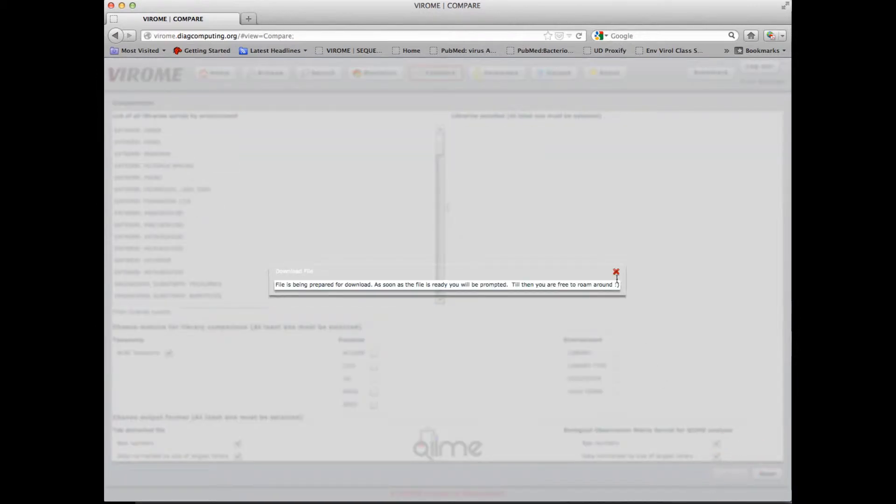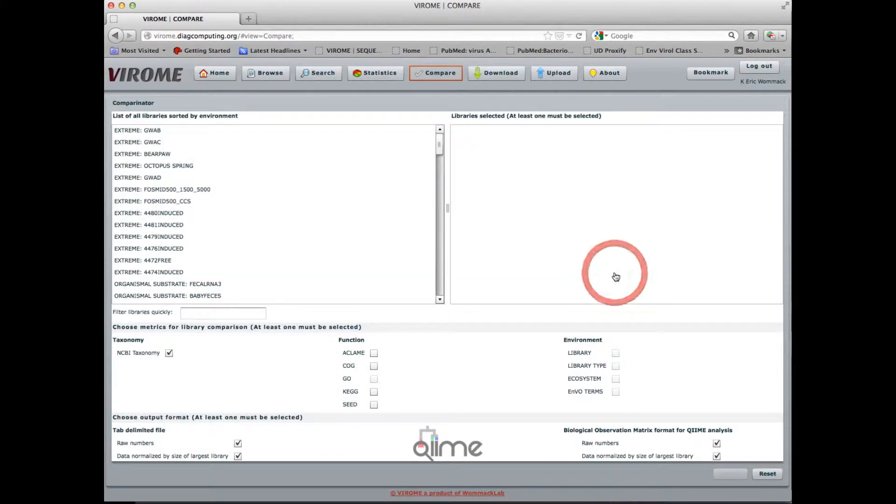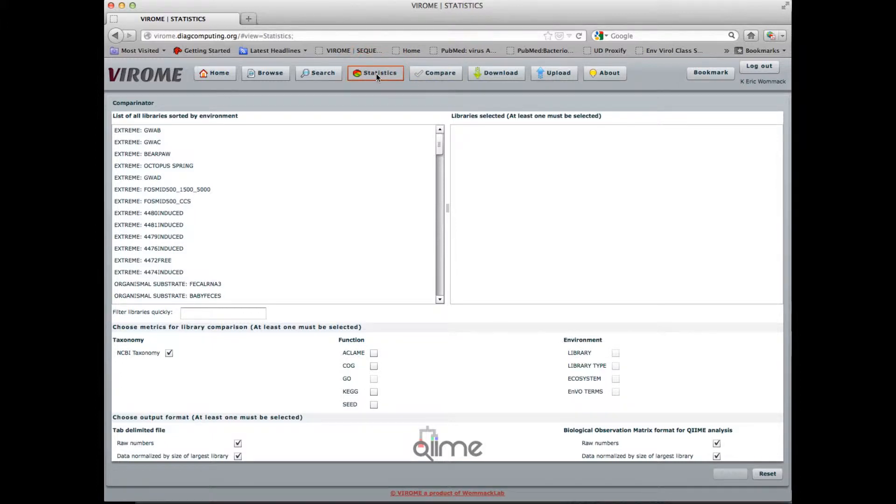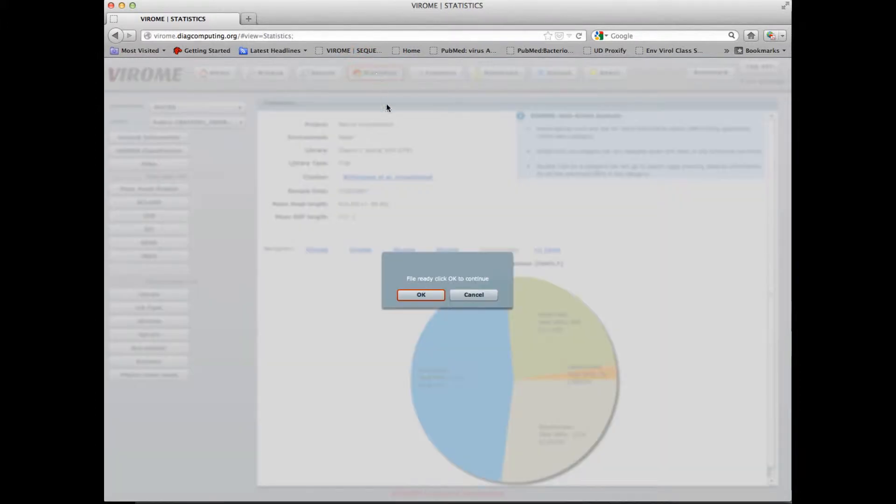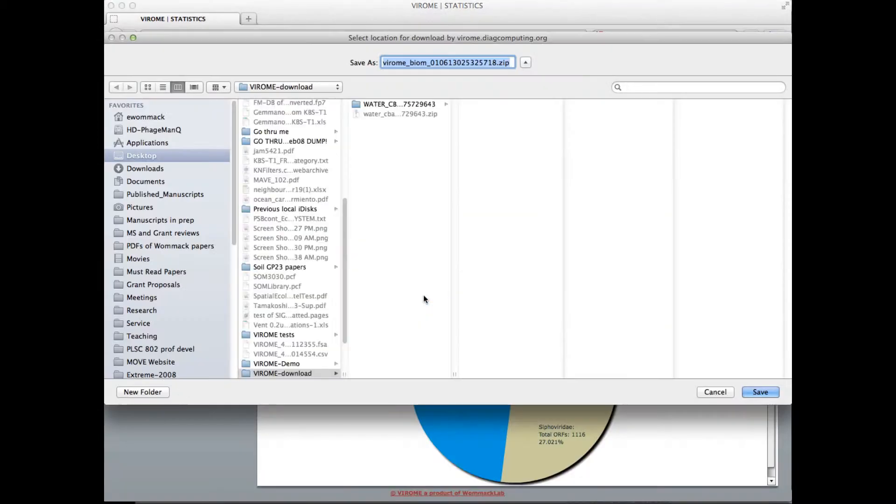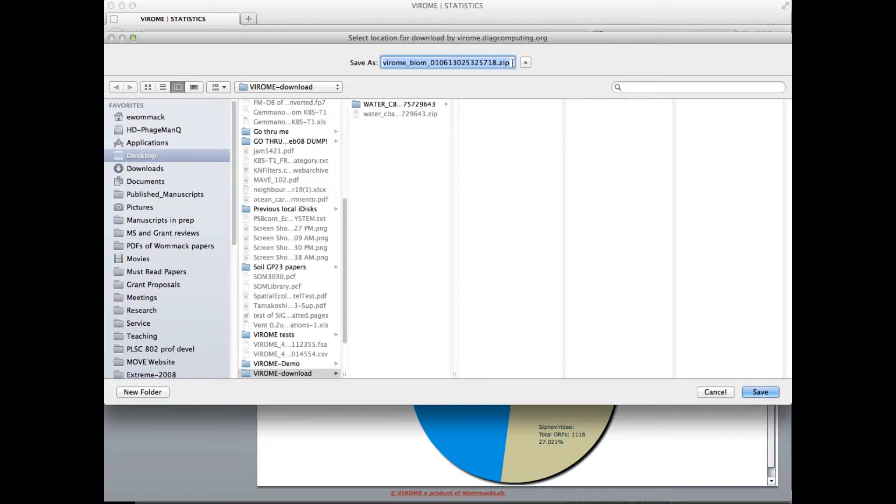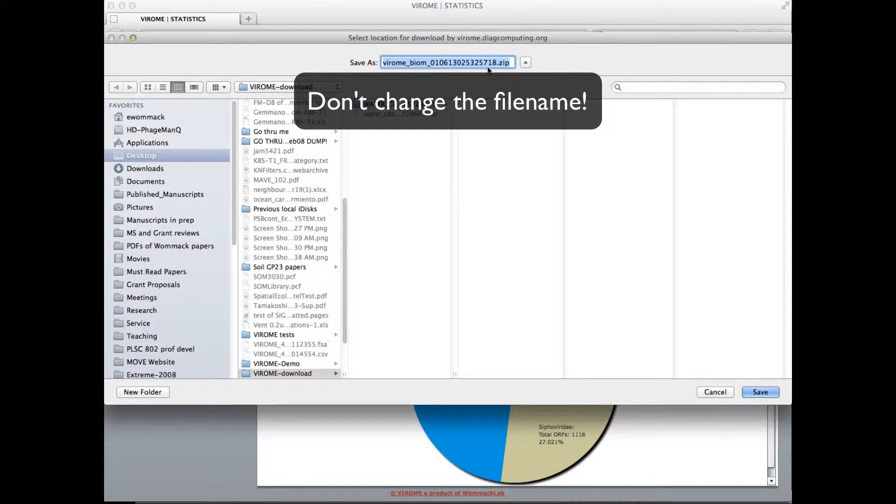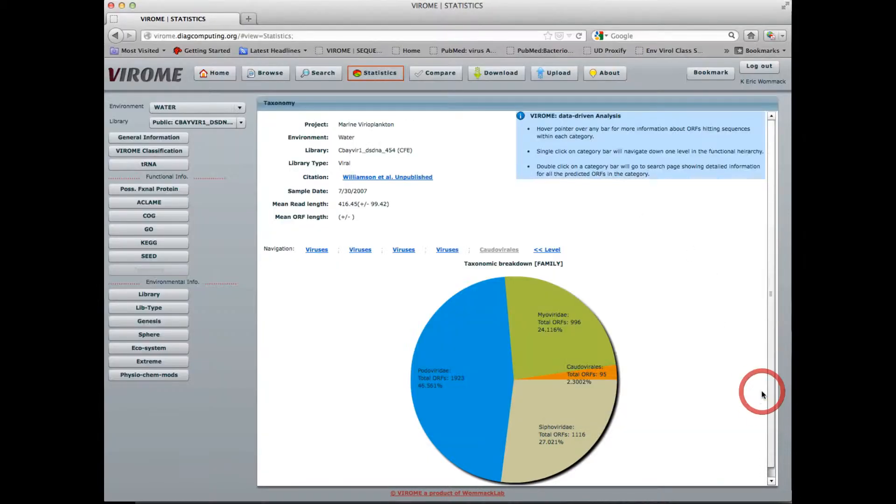And in the meantime I'm free to roam around the application while I wait for my data. Then I get a dialog box here that says OK to download. So I direct my file where I want to download it in the finder. And actually do not change this file name, it's a zip file, so I save that.